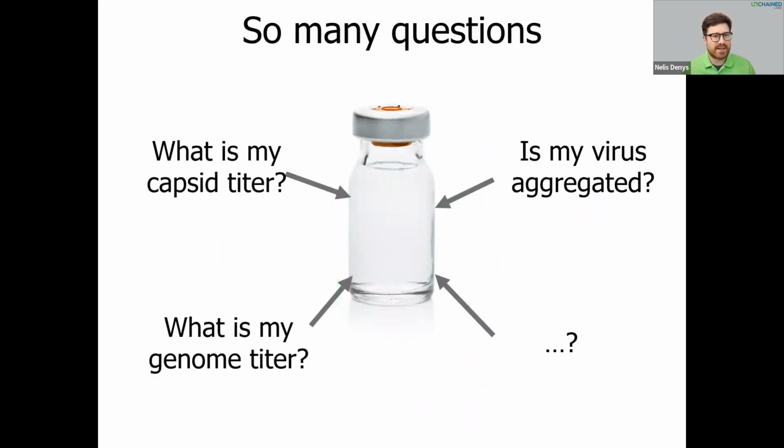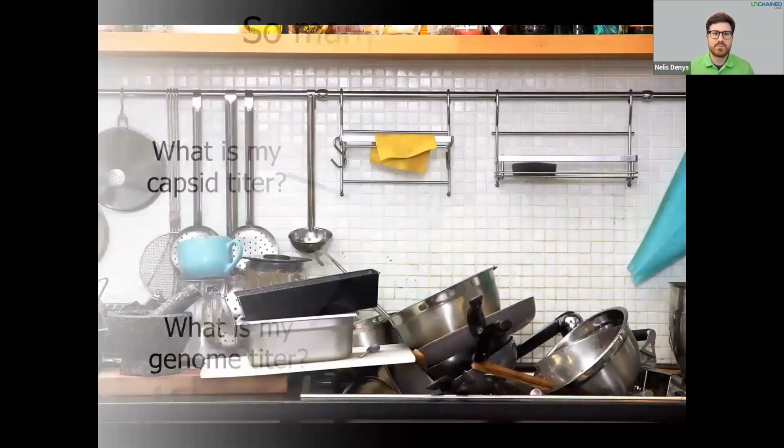Now, something as complex as adenovirus comes with a lot of questions. Is my capsid intact? What is my capsid and genome titer? Is it at the right size? And so on. It requires a lot of different characterization techniques to try to answer these.